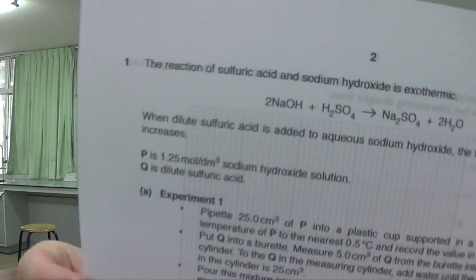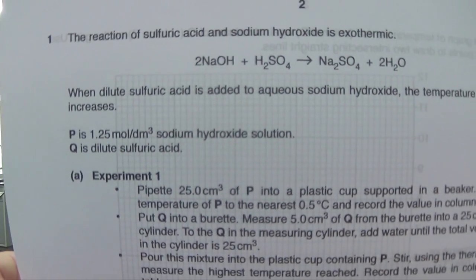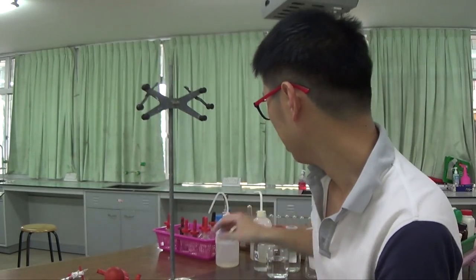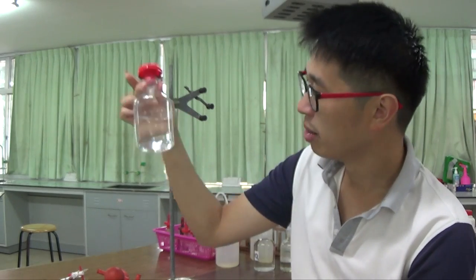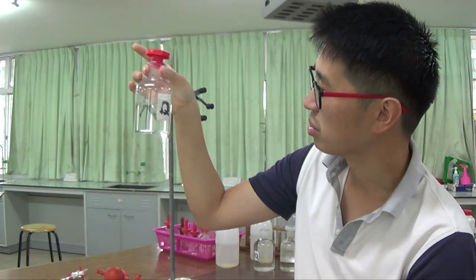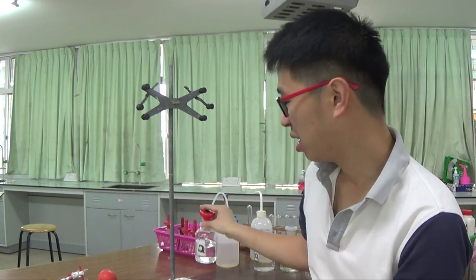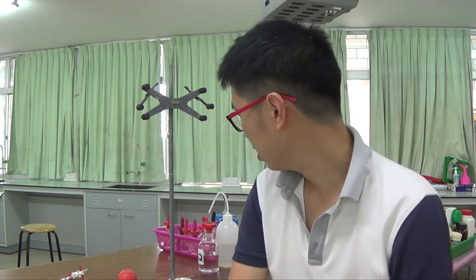The acid here is sulfuric acid. So they told us that P is sodium hydroxide and Q is sulfuric acid. I'm just using leftovers from some students in the school that I'm in at the moment. These leftover chemicals don't keep for so long, obviously, because when students do new practicals, the old chemicals are sometimes disposed of to make space, and these are just the leftovers from those chemicals.